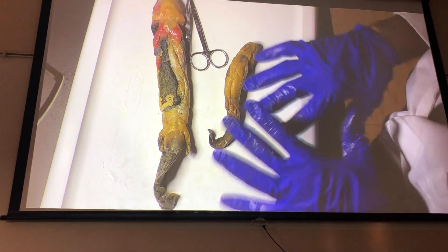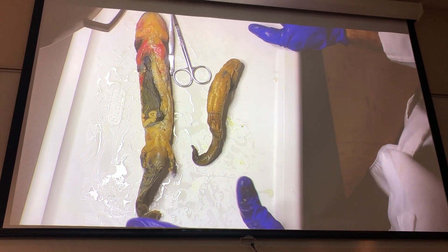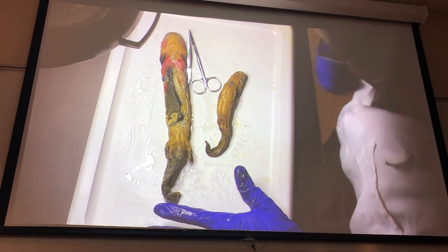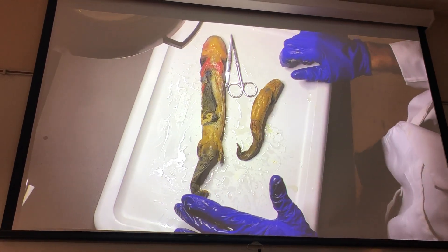For blood vessels, the tiger salamanders are worthless. You might be able to see a few, but they're not injected and they never bring the blood out, so they're going to look like little round threads. It's going to be a bit of a challenge seeing things. The mud puppies are really what will be tagged on your practical for blood vessels.